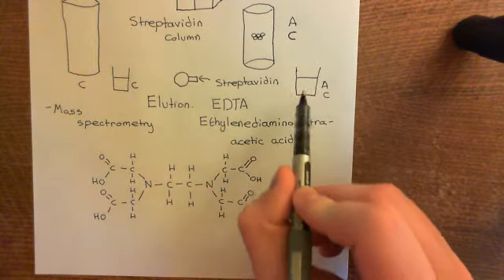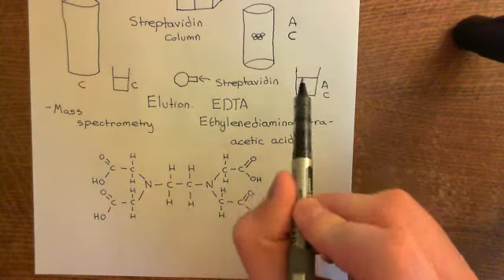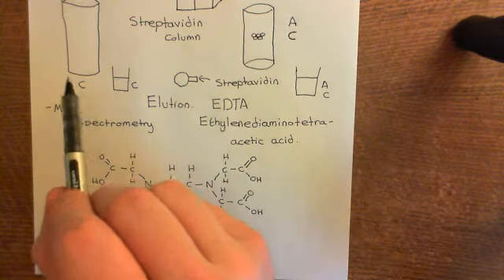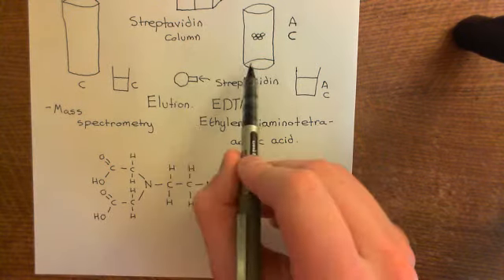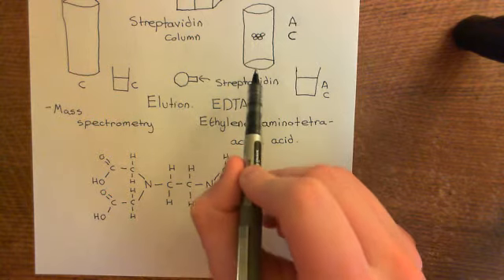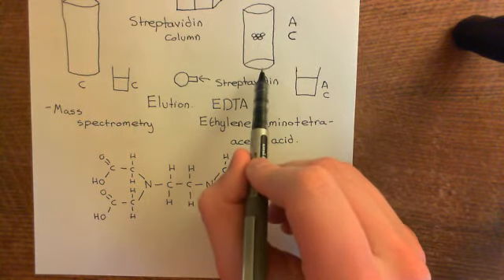Okay, so we're looking for which proteins bind in the non-control but don't bind in the control, because those are the ones which only bind to the beads because they have BMCC molecules added onto them, and therefore those are the proteins which originally had palmitoyl groups bound.